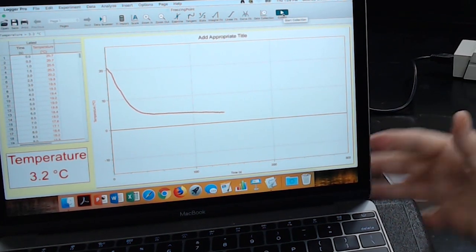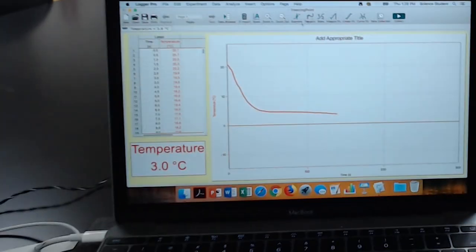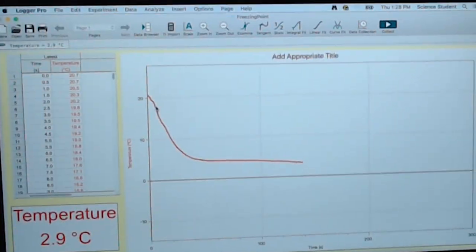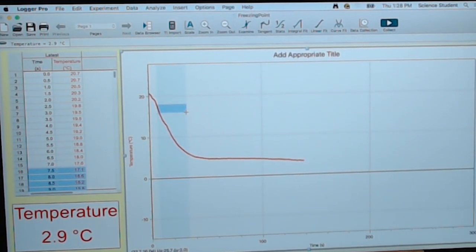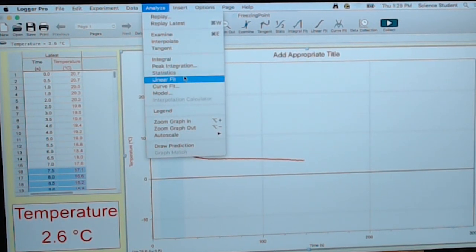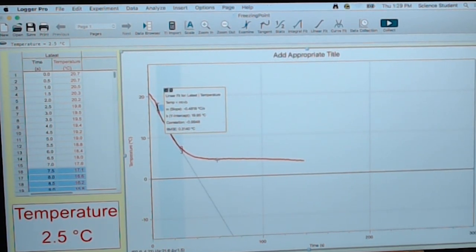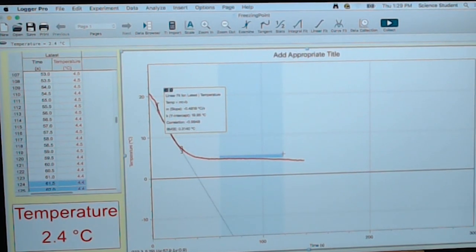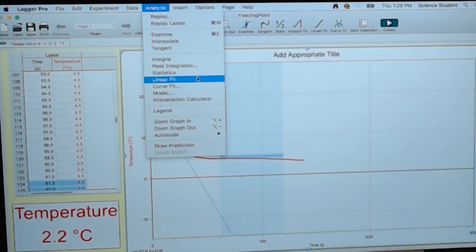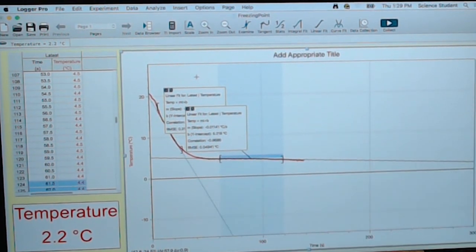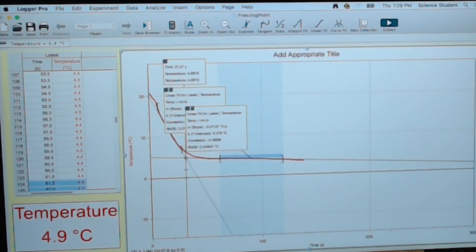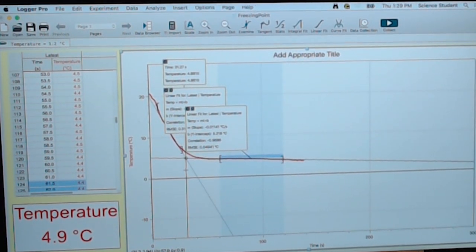I'll go ahead and leave this out of the way. And then we need to do our two linear fits again. So I will pick it up right here where it's dropping in temperature. Yeah, that looks good. And then analyze. Linear fit. And over here. Do the same thing. Select a range. And analyze. Linear fit. We've got our place where the two lines cross. That will be the official freezing point. Yes, there we go. So 4.86 degrees. Both of them say 4.86. Looks like we're all done.